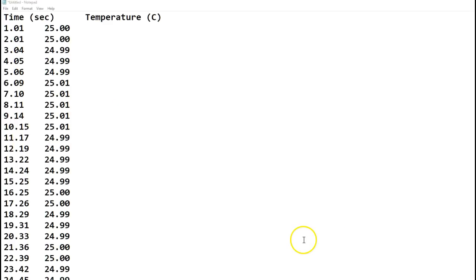Okay, here's the data for lab 17. Let me get it ready for you. Okay, again, here's the lab data for lab 17, the heat of fusion of water. So I'm going to scroll down, and you're going to get the initial temperature, you're going to get the lowest final temperature, and you're going to do final minus initial for your delta T.